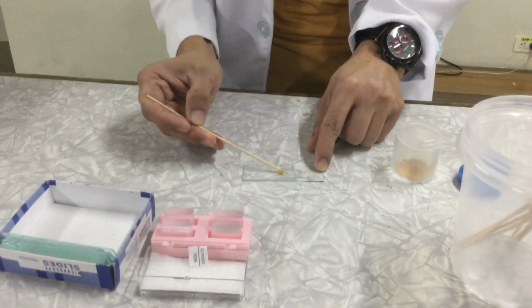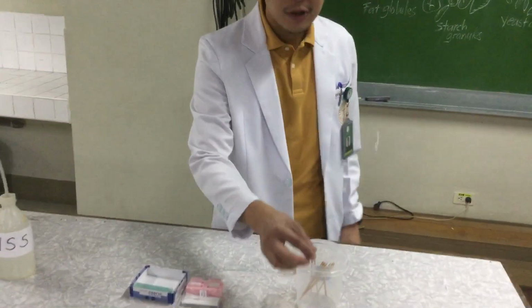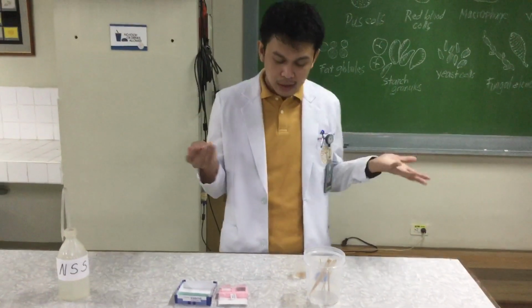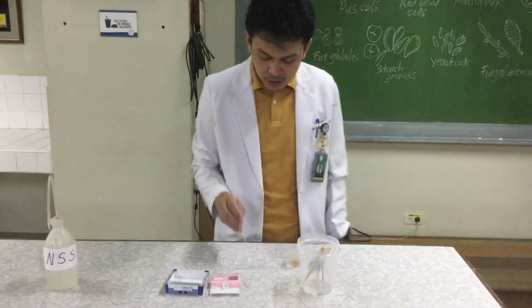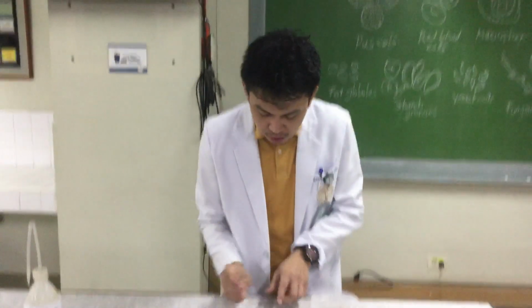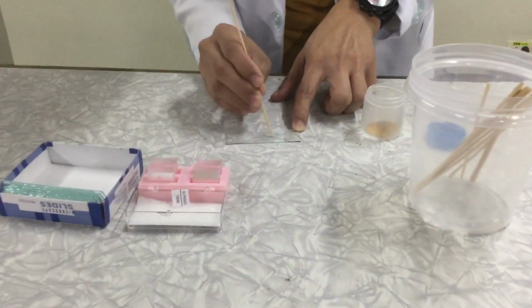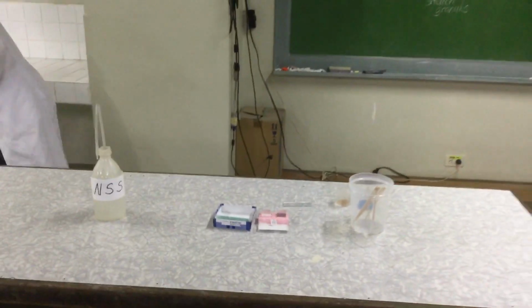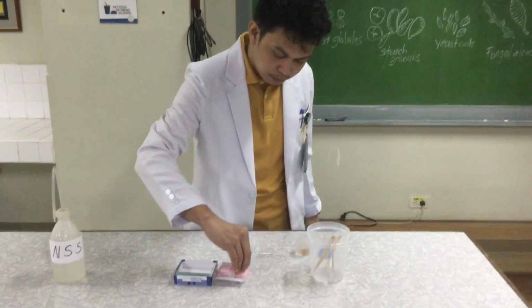That's a homogeneous sample already. If there are large artifacts or particles in your stool, because sometimes there are lumps, you can use another applicator stick to remove or crush those particles. Alright, now, using the cover slip. This is the cover slip.